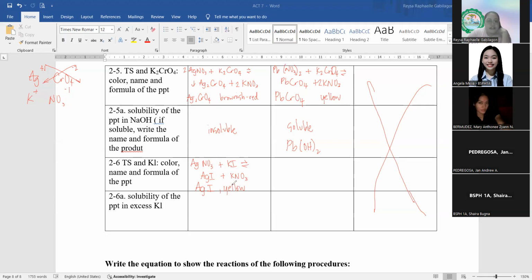Okay? Did you get this? Did it turn yellow? Kindly tell me if you got anything here. Only in the lead. It didn't turn yellow. So here you had a reaction. This one is insoluble. And then, here you had a reaction.